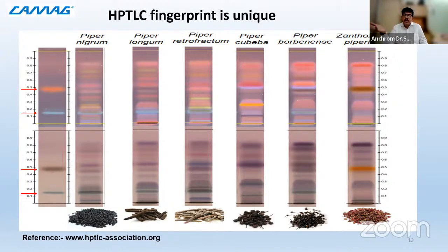That also we can find out by doing a national survey, different parts from different vendors, different samples, and you can compile that and see how much is the variation. Time points are there when the sample is being collected and all those things. So if properly done, we can actually standardize this. The monographs which are already there in USP, these studies have been done, and you get very standardized monographs of this.